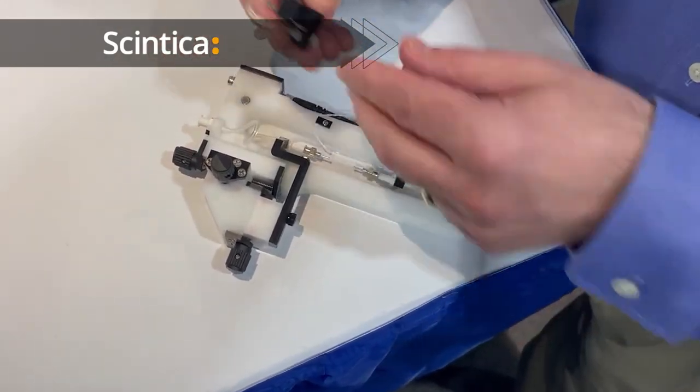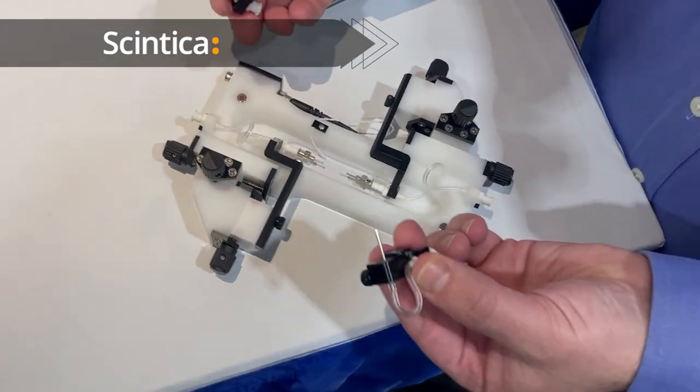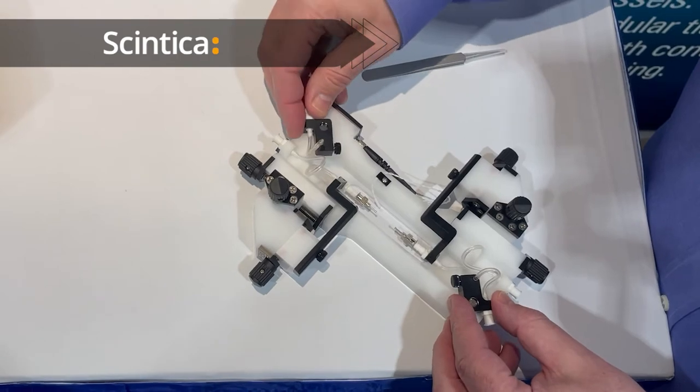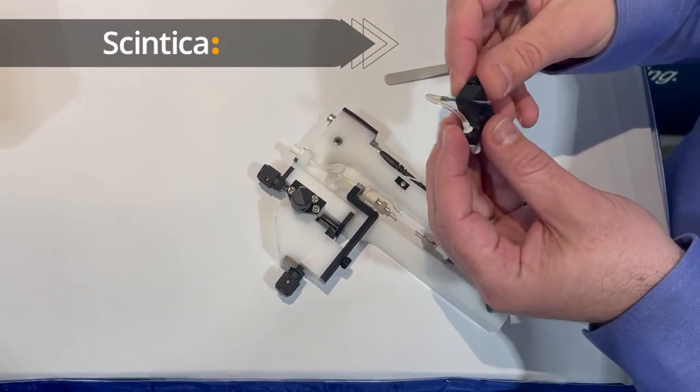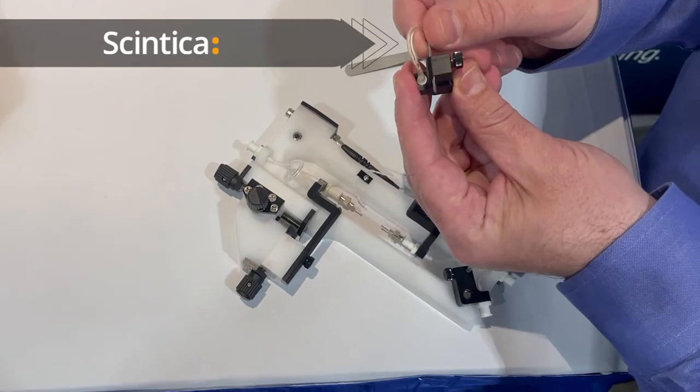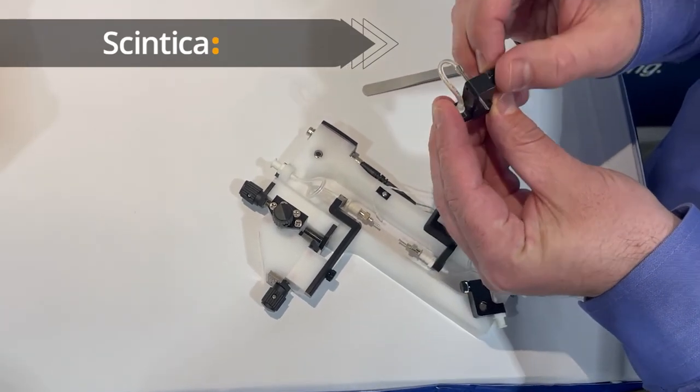The inflow and outflow of the bath is achieved using these tubes here which are held magnetically onto the bath, and you can adjust the height of the inflow and outflow suction and delivery pipes using this set screw to achieve your desired volume.